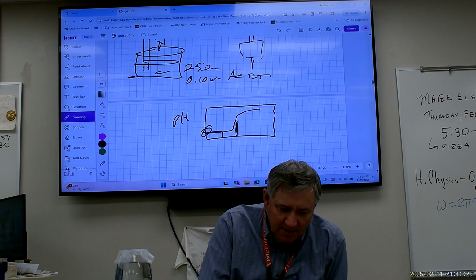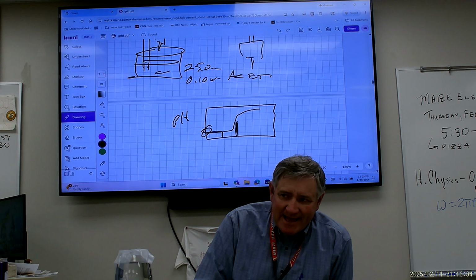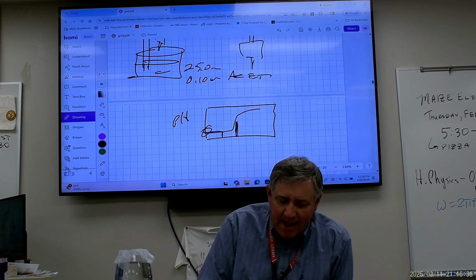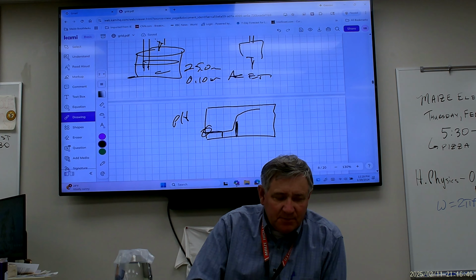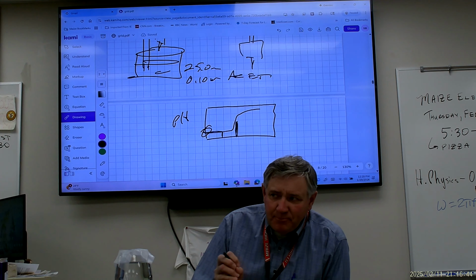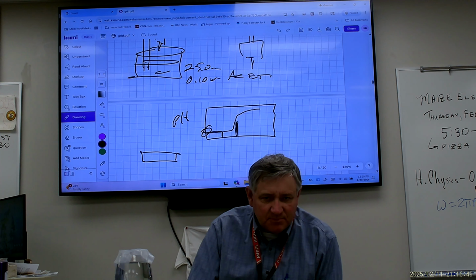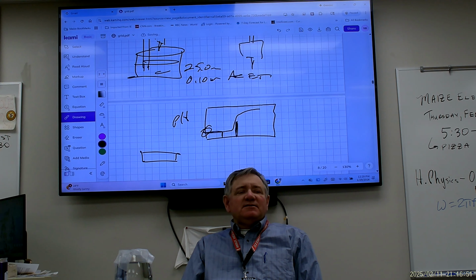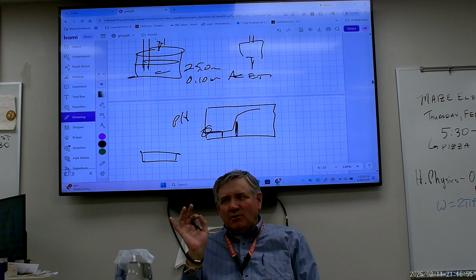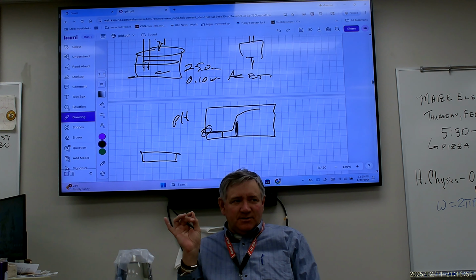On the second one, down there on calculation number 1, you're going to add exactly 0.0373 grams of sodium acetate into the 25 milliliters of your acetic acid. Your scales measure out to 4 decimal places. Don't spend 15 minutes trying to get the last half granule on there to get exactly 0.0373.